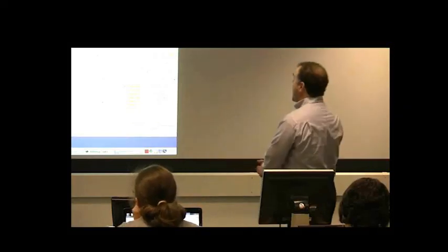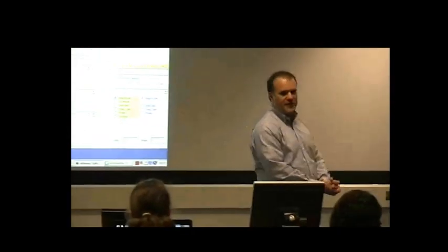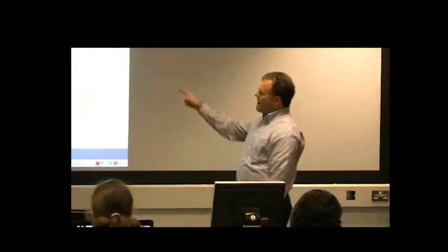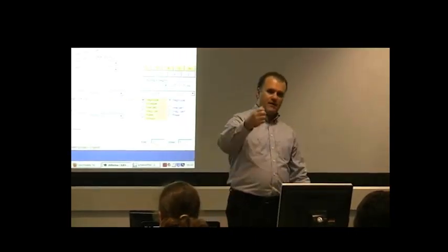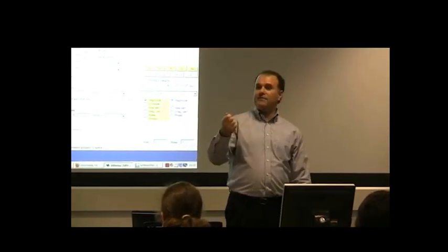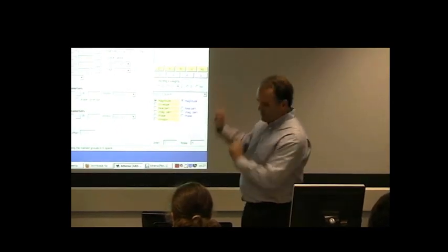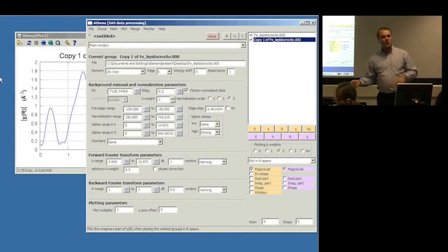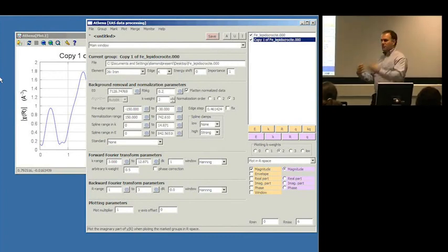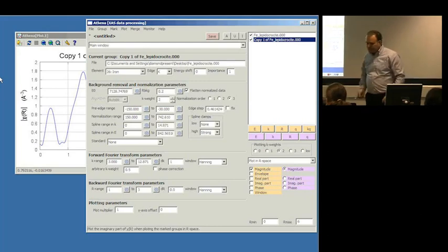All right, so where have we gotten to in terms of background removal? Well, it would seem that this magical RBKG parameter needs to be big enough to do a good job. That is, if we choose a number that's too small, that leaves behind a whole bunch of stuff down here in the region where it's not data, right? There aren't atoms down here.